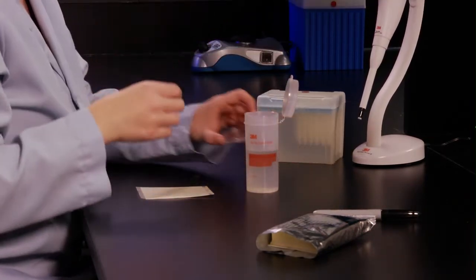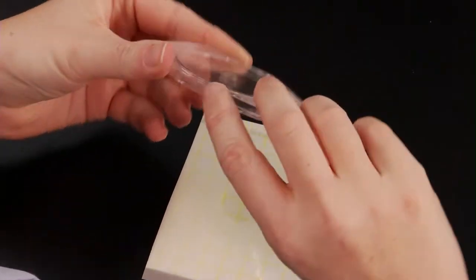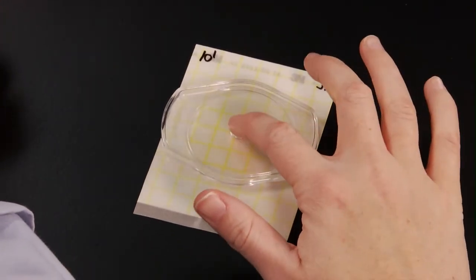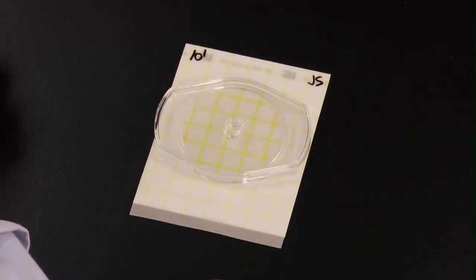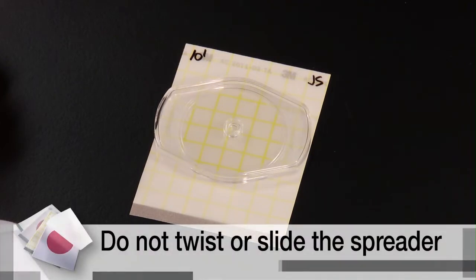Pick up the appropriate spreader, with the ridge side down, and place it on the top film, centered over the inoculum. Apply pressure to the center of the spreader to distribute the inoculum over the circular area. Do not twist or slide the spreader.